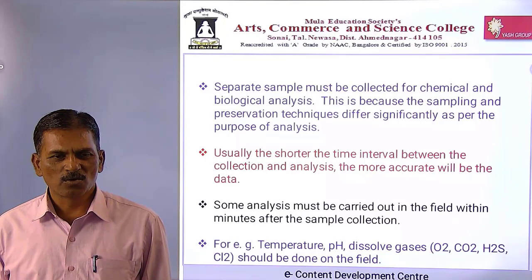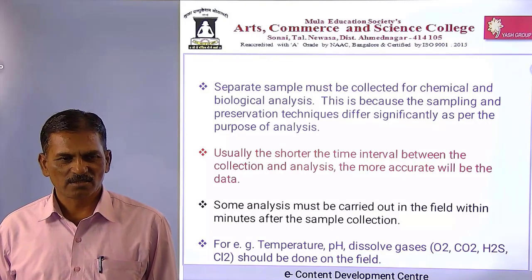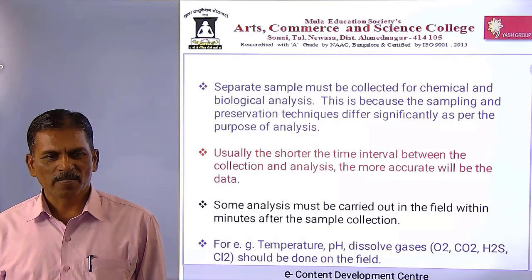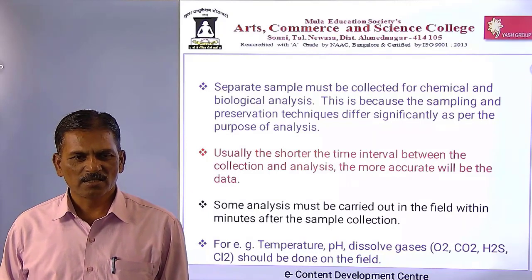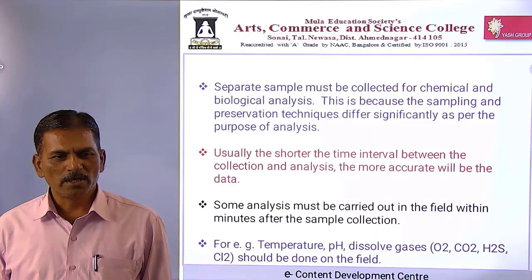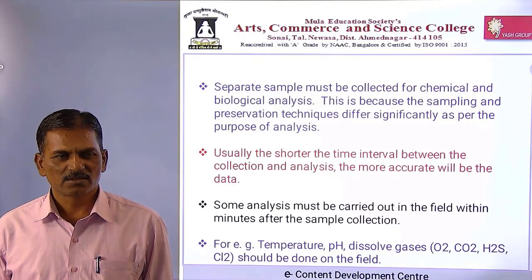Some analysis must be carried out in the field within minutes after the sample collection. For example, temperature, pH, dissolved gases like oxygen, carbon dioxide and H2S, and chlorine should be done in the field.